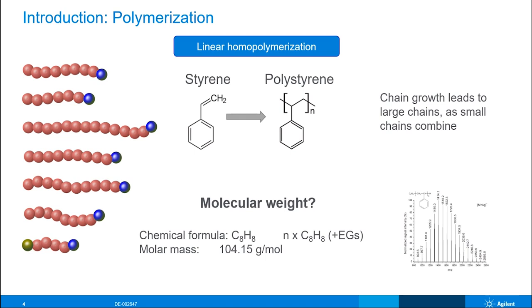In this case, with this polystyrene, if we also look down on the right, you'll see that using mass spec, we can see that there are individual peaks for each of these different mers. So while the target was likely around 1400 Dalton, what you can see is that we have a wide distribution ranging from about 893 Dalton all the way up to almost 2600 Dalton.